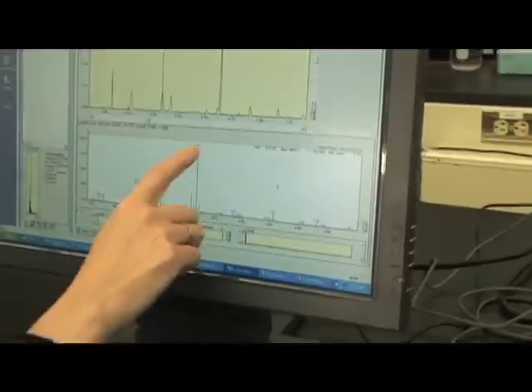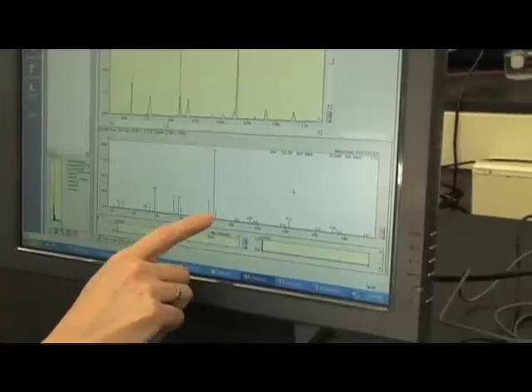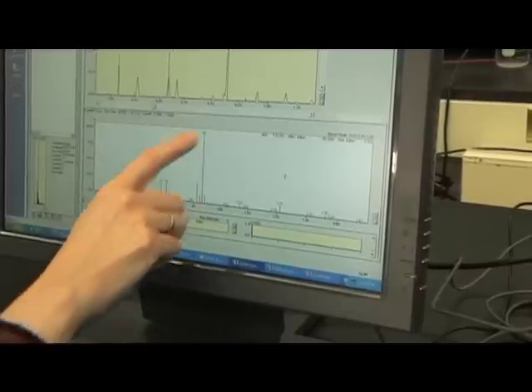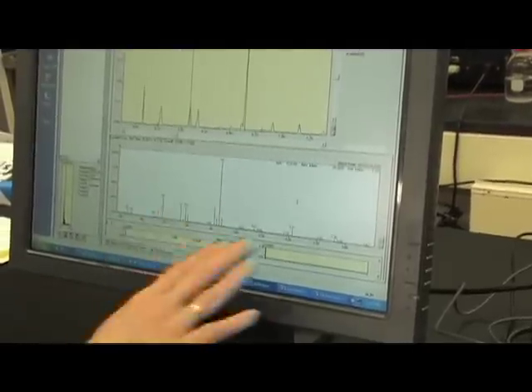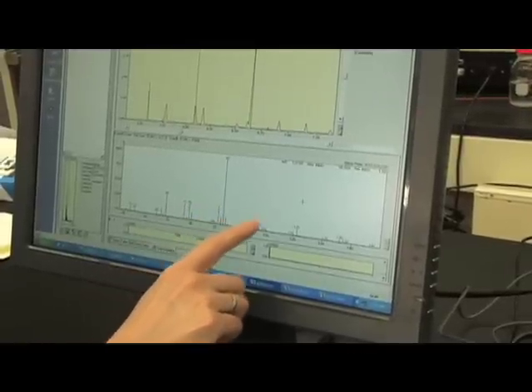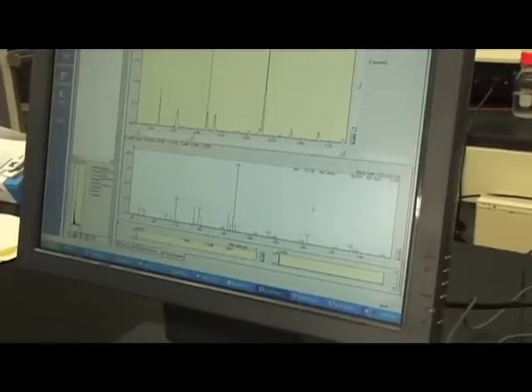The number above each line represents the molecular weight of each ion. So for instance, this is a molecular fragment that has a molecular weight of 93. And this is the most abundant one because it's the most stable in the bunch of all of these ion fragments. But you see there's a particular pattern here. And this pattern is the fingerprint for this particular compound.